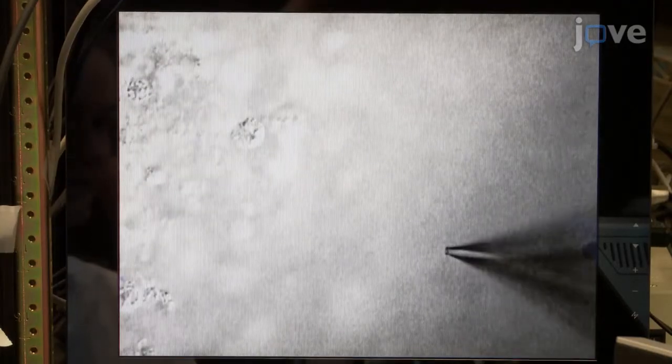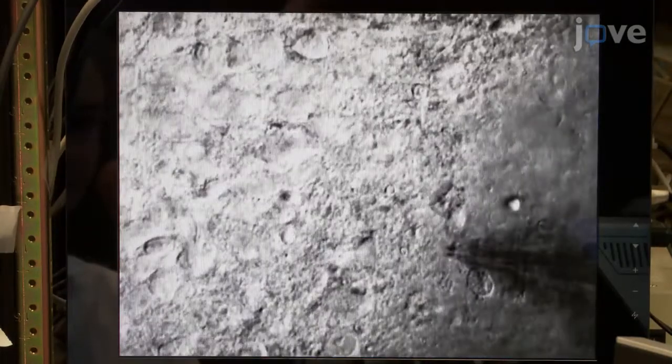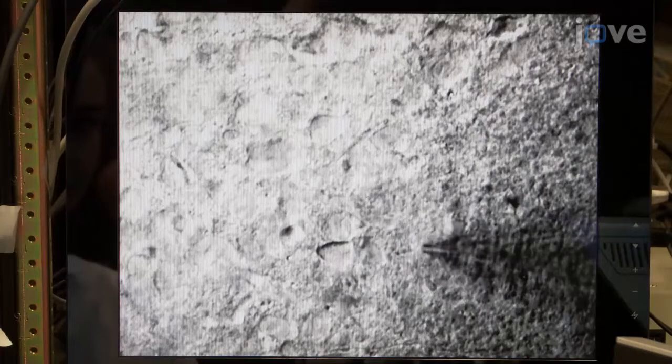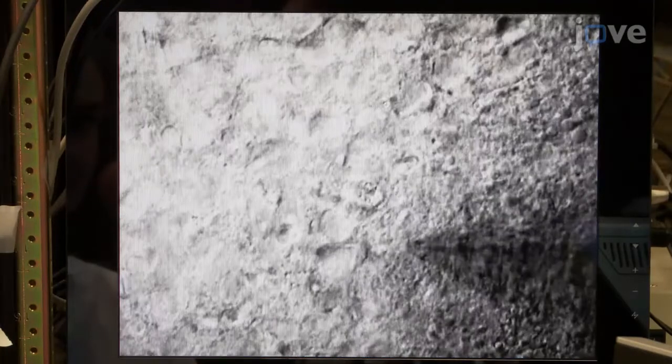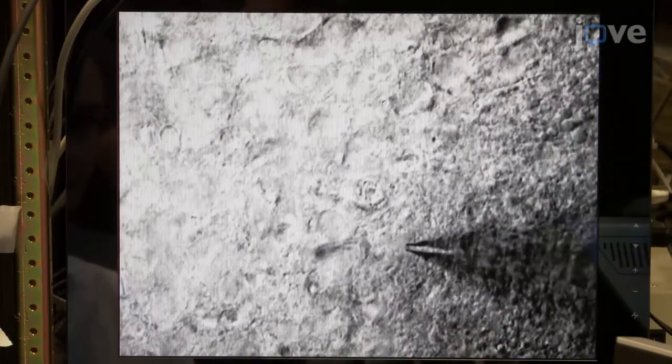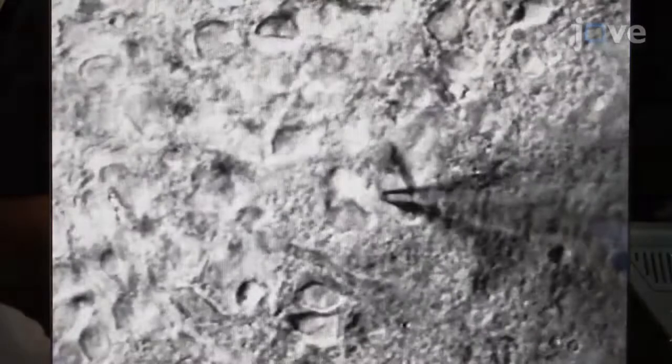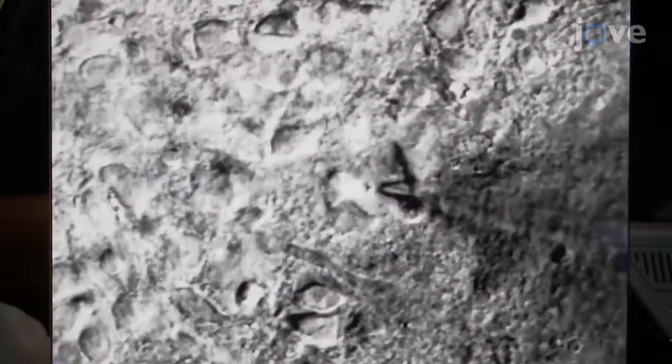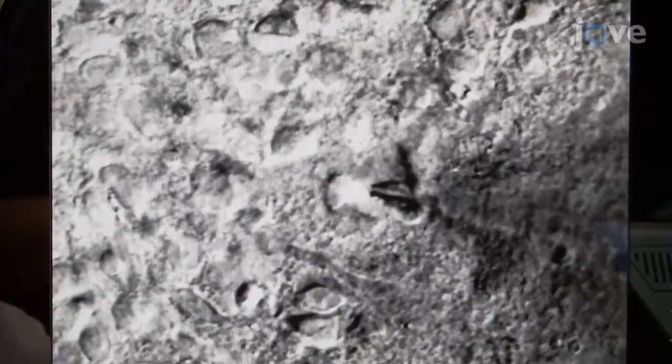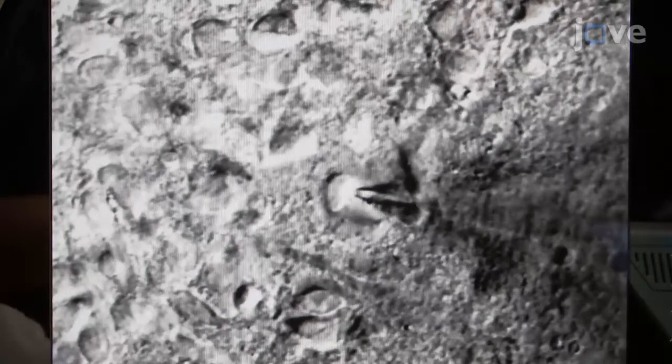Next, select a healthy cell with an intact membrane and approach the tissue with the pipette. The positive pressure should cause a slight disturbance on the tissue. Slowly bring the pipette closer to the cell in a diagonal motion until a small dimple is formed on the cell surface.